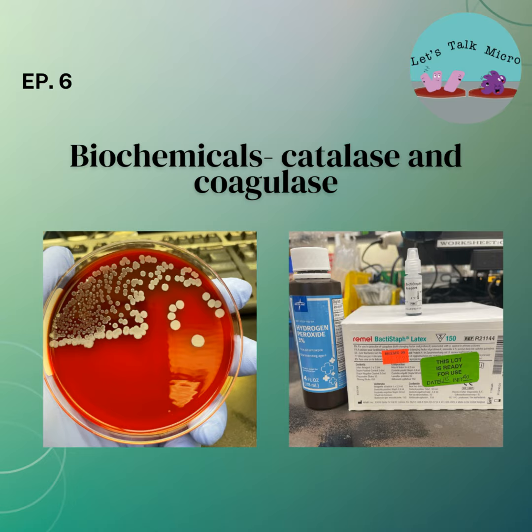Typically, we look at them after they have been incubating for 18 to 24 hours. We examine the agar and determine if there's growth or not. Then we also determine if it's pathogenic or not. This is based on the source. Like I mentioned before, we have bacteria in our bodies. In some areas, they are normal flora.